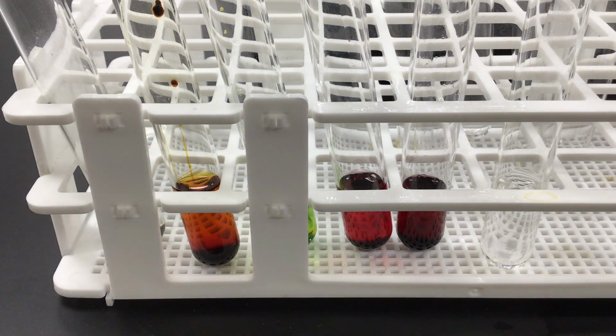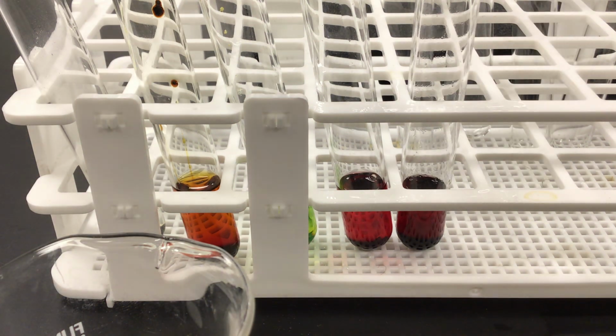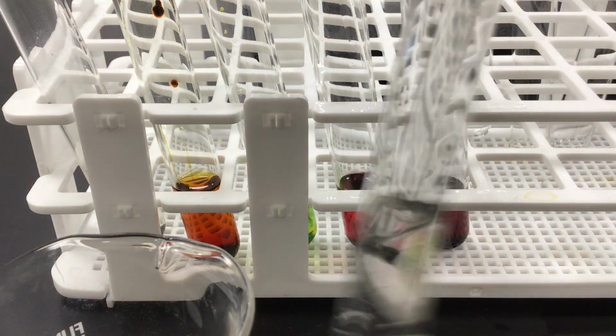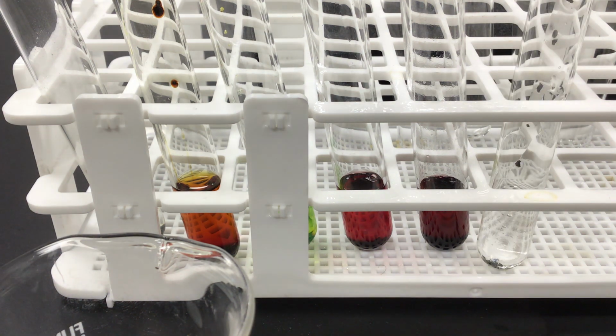Then I'm going to add my iodine. This one you're going to probably have to mix a little. So I'm going to get my stirring rod and nothing happens. I am going to rinse off my stirring rod. All right, and then, so we can add in our data.